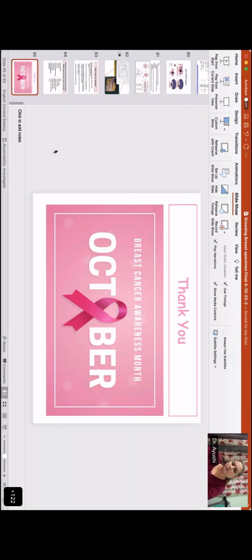And sometimes it is really difficult to sample because it is embedded within the fibrous tissue, within the fibrotic bed. So it's very thin, serial slicing, if you know the marker is there. And it is actually a big help to the pathologist, especially in the post-chemotherapy specimen. Actually, it is not done in most places because that small marker is very expensive. So generally only patients who are able to afford it get a marker while the biopsy is being taken. The presence of that marker is identification, and sampling that area is very good for the pathologist to say that yes, we have adequately sampled the tumor bed.